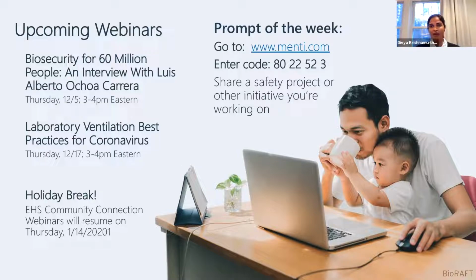So some of the chemicals are not automatically reordered, but the consumables, for example, the spray alcohol, the Septahol spray, et cetera, are automatically ordered, but they would count towards the limit. So that's how we separated those two things. And then similar to what Anne said, we have separate COVID-related PPE with the face coverings and very limited use of N95, because that's limited to healthcare professionals. So I don't know if that answers the question, but it's kind of separated in that sense.